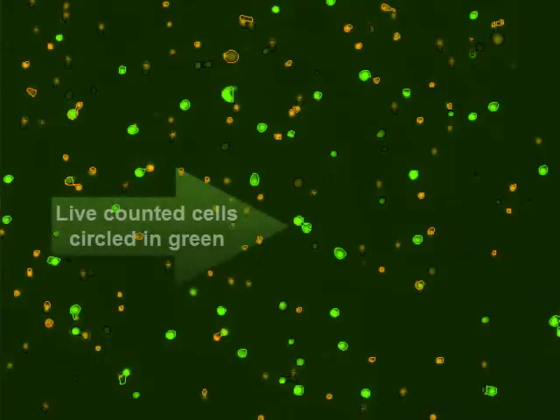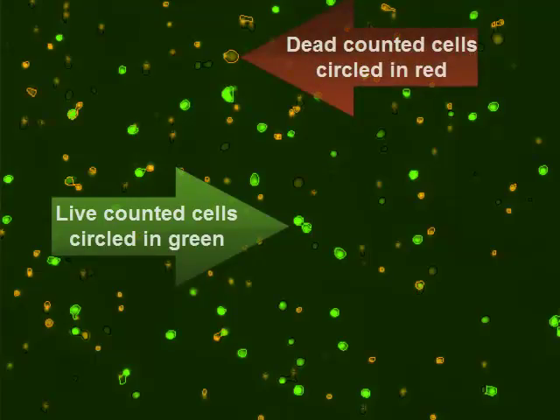Bright field images can be viewed to show cell morphology. A fluorescent image showing green fluorescent live counted cells and red fluorescent dead counted cells can also be viewed.